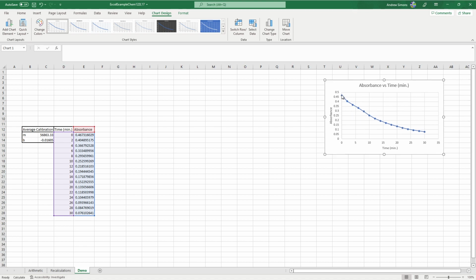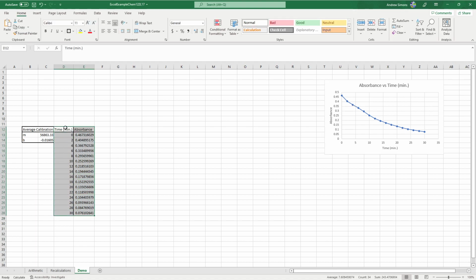So as for the numbers you're going to use in order to plot these two data sets, obviously we know time is measured 0 to 30 minutes, but you guys don't necessarily have absorbance values. So I worked that out. It's finished. I will generate a set of absorbance values for each of you to use, and I will send that out to you guys in probably groups. I'll figure out how specifically I'm going to do that, but sometime today I will send out that data and hopefully have this video uploaded somewhere where you guys can look at it, and we'll be able to go from there.